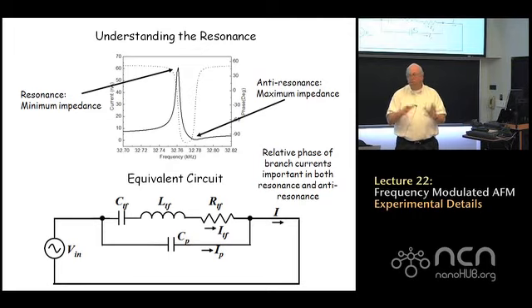Huge advantage if you're trying to do experiments in vacuum, because if you're going to do experiments in vacuum, you have to worry about the outgassing of the photodiode. You have to worry about outgassing of the laser diode that's used to illuminate the cantilever.